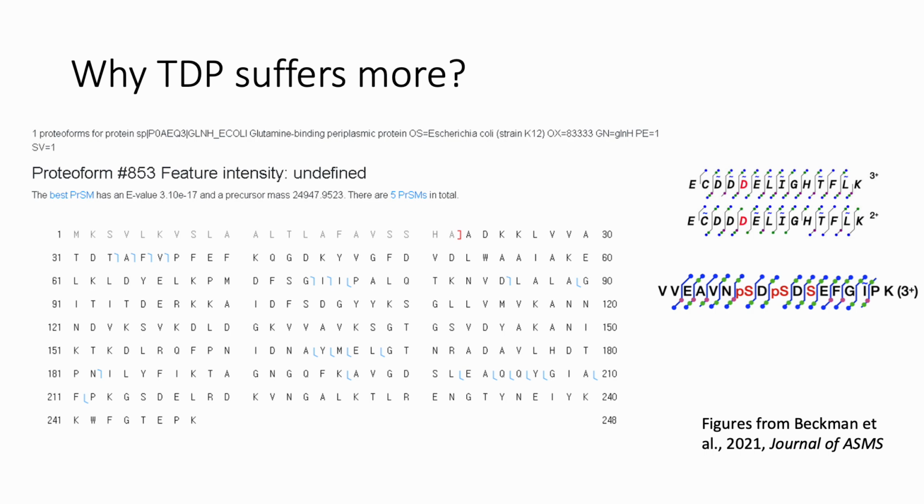So in top-down, precursor mass errors do not affect match scores as much as in bottom-up. Therefore, in most cases, false identifications with precursor mass errors have relatively high scores in top-down as compared to bottom-up, which are not modeled by decoy hits.